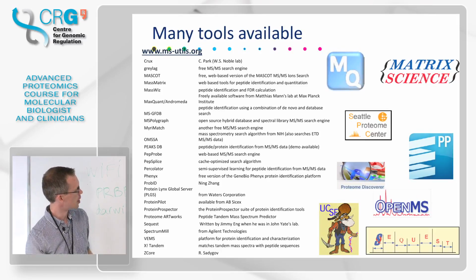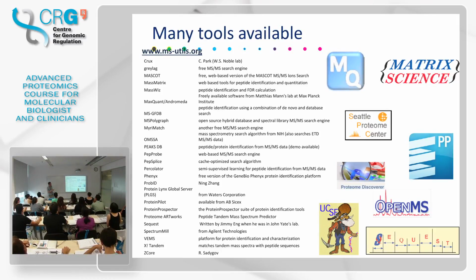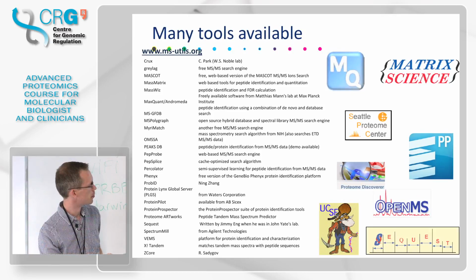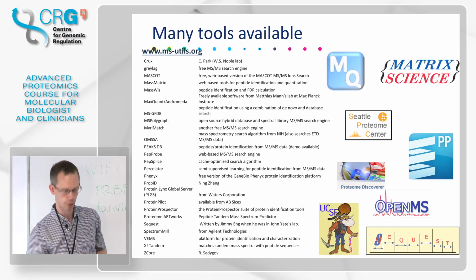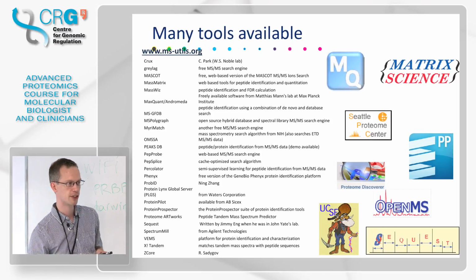So what you'll use later, I think, is this MaxQuant software here. It's also here, MaxQuant. That's from the Matthias Mann lab. But then also some of the others. Are you also going to do some Mascot searches? Or no, not really. Okay. So, but at least the MaxQuant you'll learn about later.